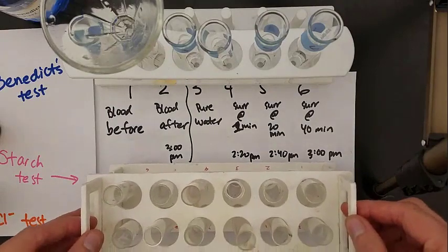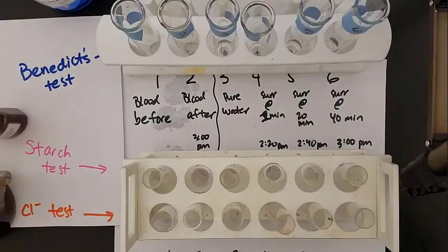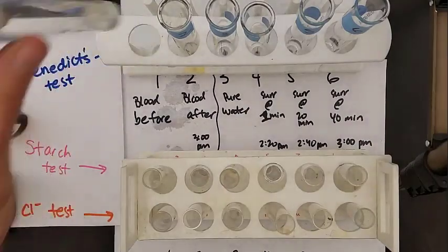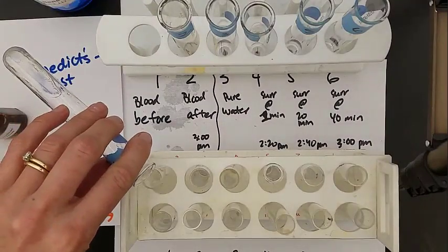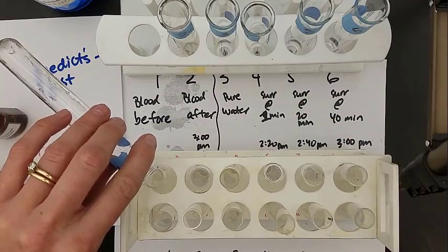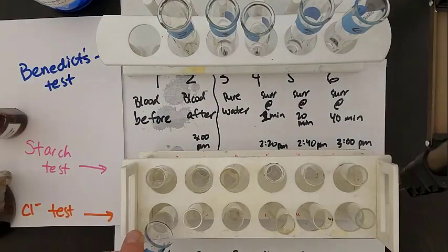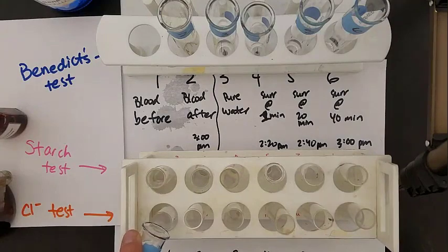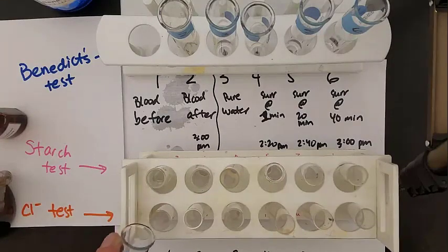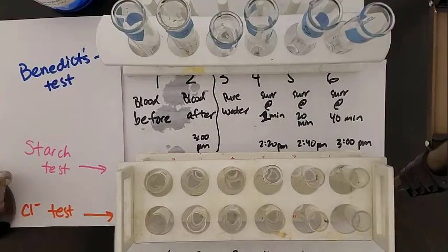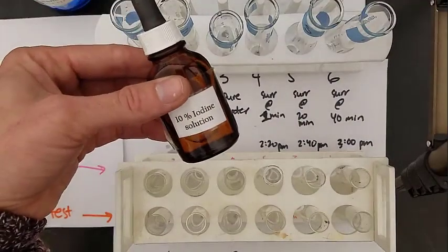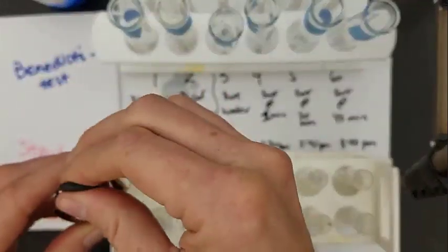Then we're going to take those samples and divide them up into three samples to test for three different things. We'll pour a little solution from each big test tube into two smaller test tubes, doing that for all six test tubes. So we have three sets of one, three sets of two, and now we're ready to do the iodine test.